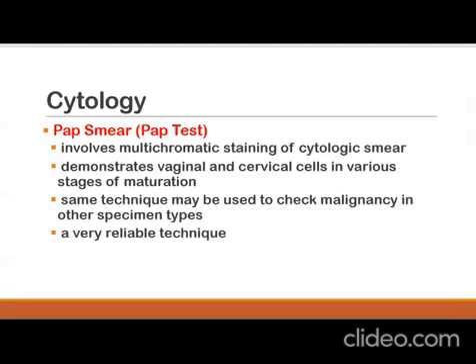Okay? So, if you want to know more about the advantages of Pap smear staining method, you can refer to your lecture, kasi I think i-discuss yan siya, or you can read in your book. It's actually stated in page, sasabihin ko na yung page para madali lang malocate. It's actually on page 312 of your book. So you can see there the advantages of Pap smear staining method.